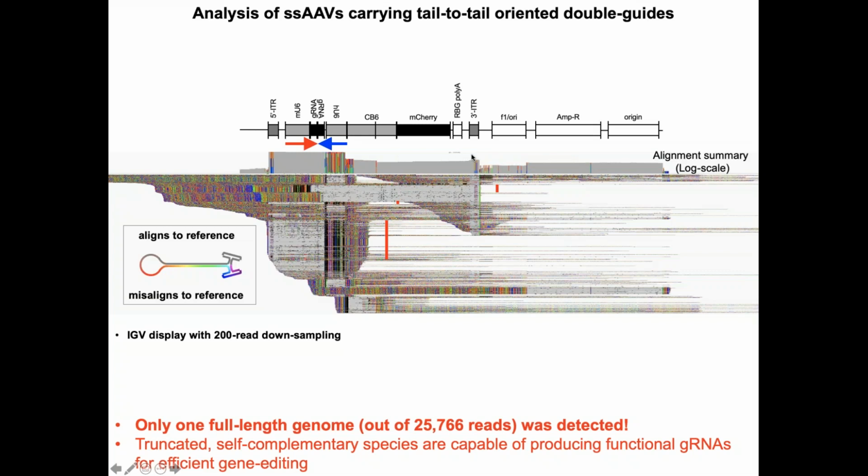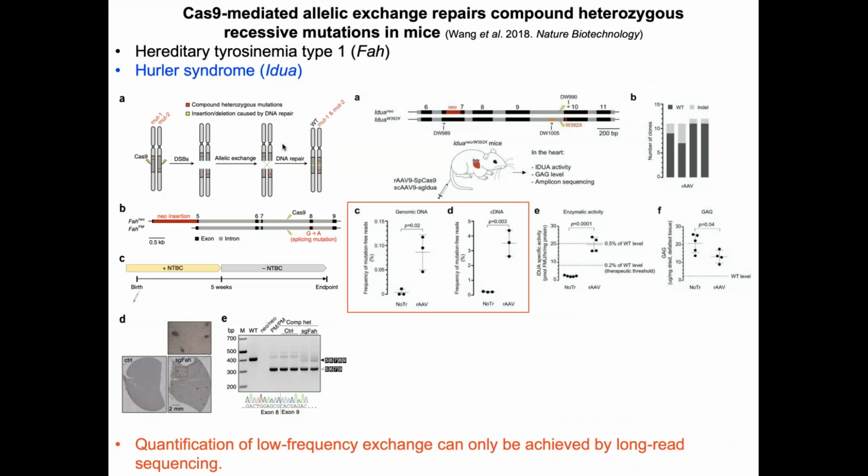And so we're glad to see that although by gel and by analysis these secondary structures do indeed compromise to a degree, we know that these vector platforms still do work, and perhaps we can even leverage these types of packaging events in future generations of vector designs that can take advantage of these anomalies that we are now just discovering.